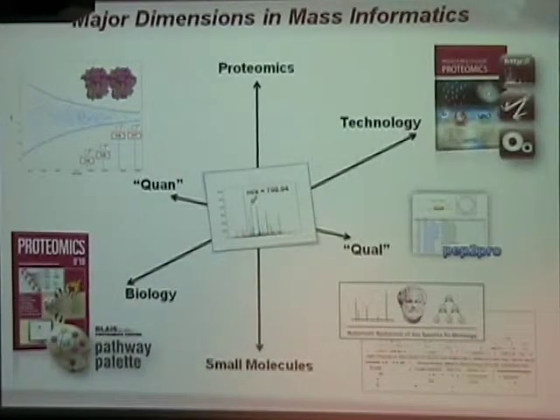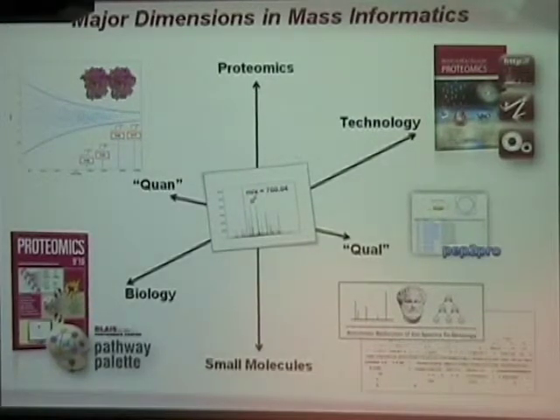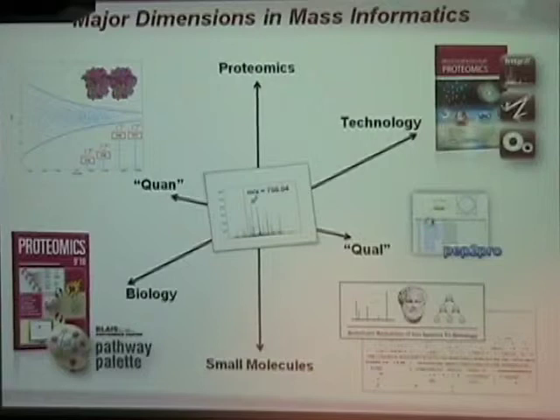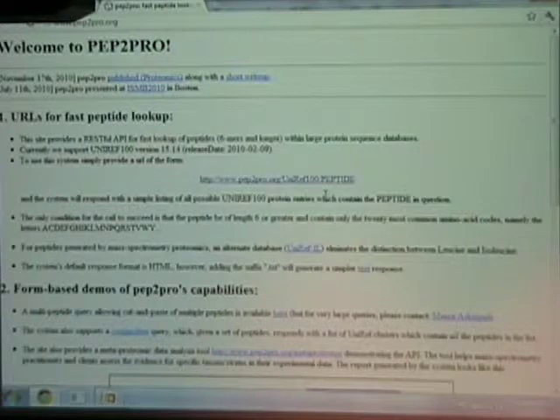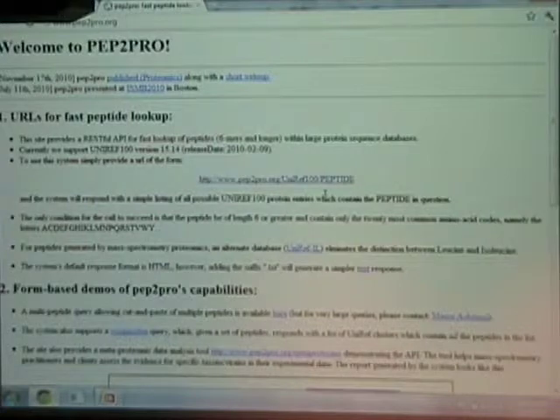And since this is a very tool-oriented talk, we're going to do two things. First is we're going to try to do some lab demos, which is certain to fail, especially since it's being recorded. And I'll start with one that doesn't require a lot of setup, and it gives you something to walk away with. So it happens a lot that you have a peptide and you would want to just make sure where it shows up in the proteome. Sometimes you want to know where it shows up in the entire proteome. So you look up the peptide.